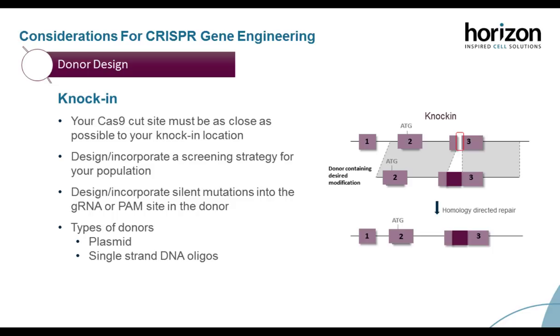So I'm just going to run through really quickly these oligo donor design and plasmid donor design tools. There are really good resources available for you to get more information on this, which I have linked here, but will also be at the end of the presentation in a resources slide.